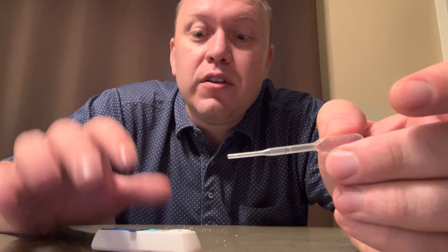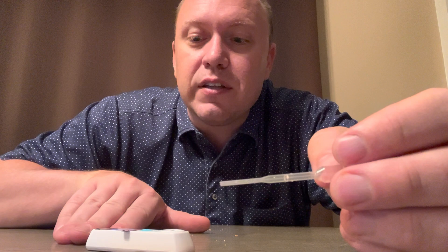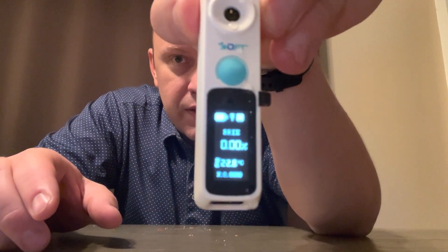We'll start things off by calibrating this, and it's very easy to do. You put a drop of water to completely cover the sensor, turn it on, and you'll click fast and then slow and hold it in. It'll go from measuring to zeroing — you're going to leave it flat, and it'll take a couple of seconds and then it says zero complete. Just like that, and then you know that you're calibrated. Then I'm going to take a tissue, wipe this off and dry it, and then we'll get to testing.